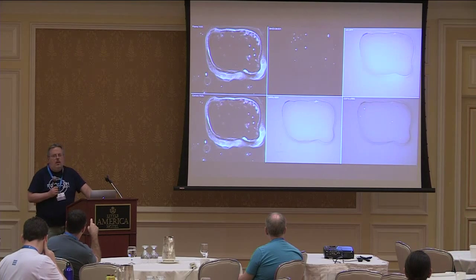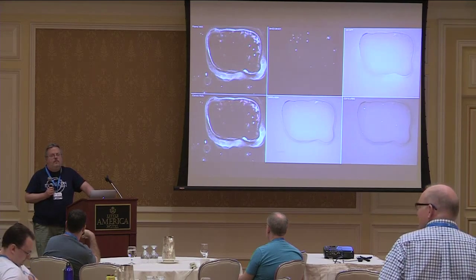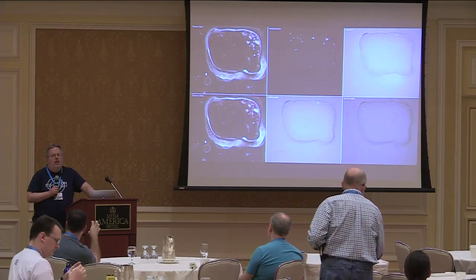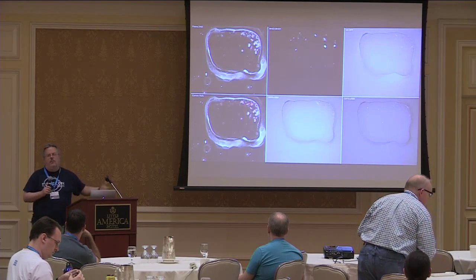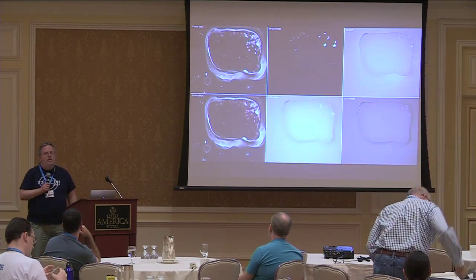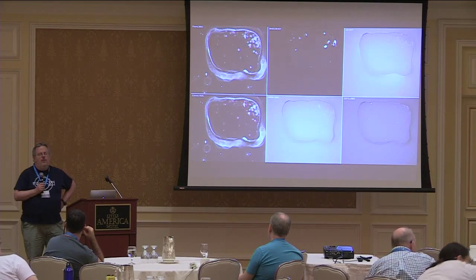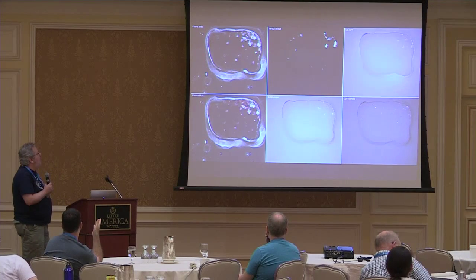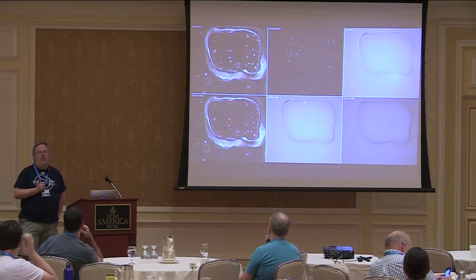I noticed that there's a lot of jitter in the images. Yeah, there is a lot of jitter in the images. Is that something that you would correct first? Will that make the other steps easier? Yeah, as long as it's not too bad, it doesn't throw us off because the cells themselves are moving anyway. So it can throw us off if it's a lot, but the amount that they're jittering here, that's not enough to really throw it off. We start having problems if the jitter was more than the width of a cell, which I don't think it is. Does that affect your ability to identify the background? No, it would be more of a problem in trying to track the cells, which I didn't talk about at all here.